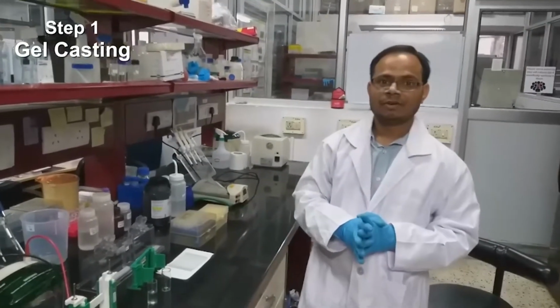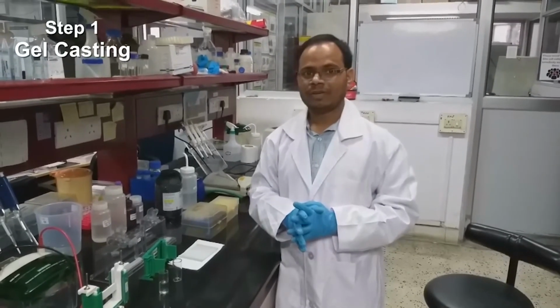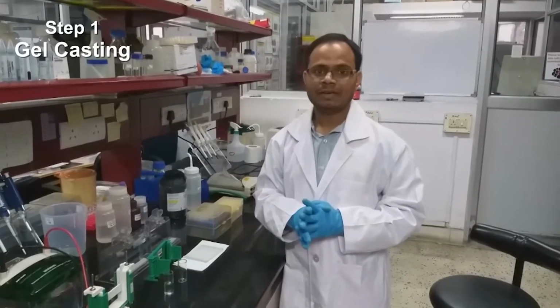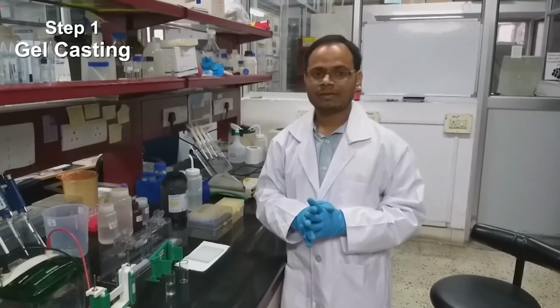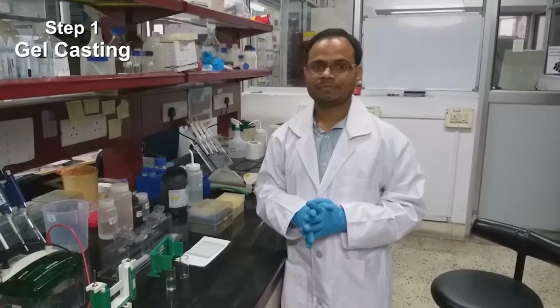After this, we have to prepare the resolving gel. For the resolving gel, we need 1.5 molar Tris-HCl, pH 8.8.